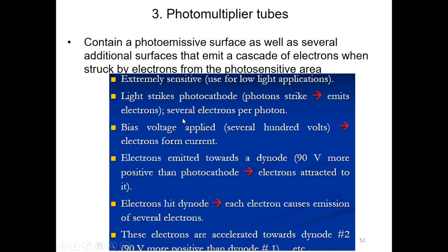Then the photomultiplier tubes. You will hear this more frequently because this one has been used widely in instruments. So in most cases, and I think maybe even now, you are familiar with the photomultiplier tubes. So let's discuss the photomultiplier tubes in brief.